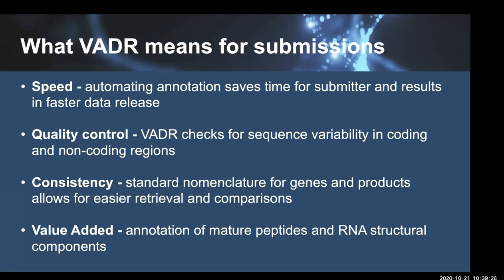Okay, thank you. Hey, this is Lee Katz. I wanted to follow up on Danny's question earlier. It produces a table file, and I don't know if this is outside the scope of this talk, so please let me know. Is there any way to get GFF output for things that use GFF for pangenomics, or if I just wanted to do some kind of rudimentary allele calling, it might be easier to use GFF?